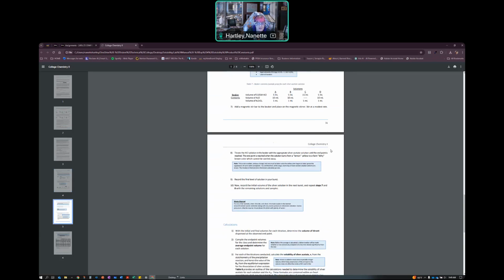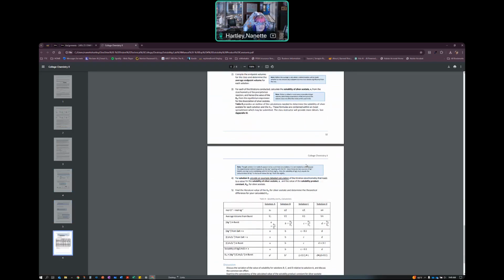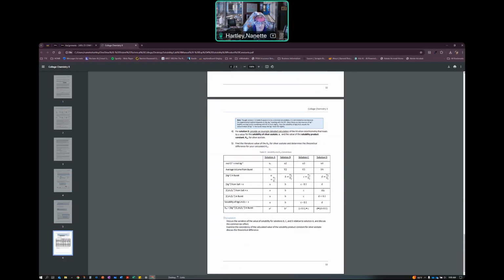So we did titrations with all of these, and then we look at the data that we get from that. Then there's a table that walks you through how we do those calculations based on the scenario that we're looking at. This is a complicated table. It walks you through how we do those calculations, all right? It's supposed to help you to understand how those calculations are done.